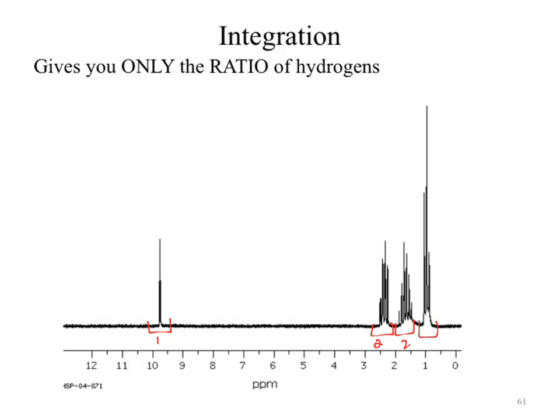2, 2, 3. I've removed some of that kind of sloppiness in the numbers, but I'm giving you the same ratio. Okay? Is that the number of hydrogens? No. Okay? It is the ratio. The other thing that you might see me do, 1H, 2H, 2H, 3H. What am I telling you? I'm actually telling you how many hydrogens there are. Theoretically, I'm not giving you the ratio now. I'm actually telling you the number of hydrogens. I have been known to screw that up. Okay? But if you see the H symbol in there, I'm actually telling you how many hydrogens are present.